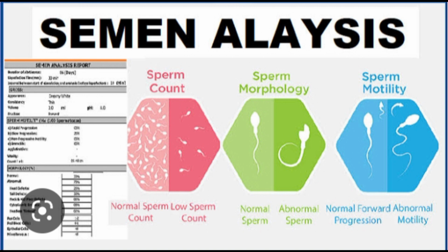Reaction. Semen is alkaline with pH 7.2 to 8. Motility and spermatozoa. The sperms are motile with flagella. To observe the motility, place a drop of semen on the slide and put a cover slip over it. Examine with low and high power objectives. A hanging drop preparation with a ring of Vaseline can also be made.